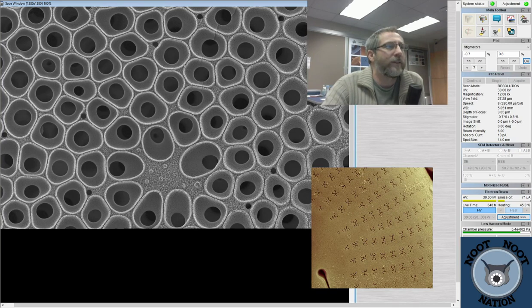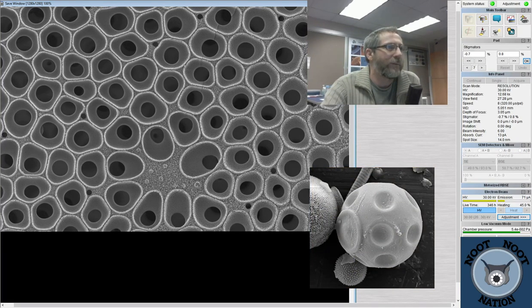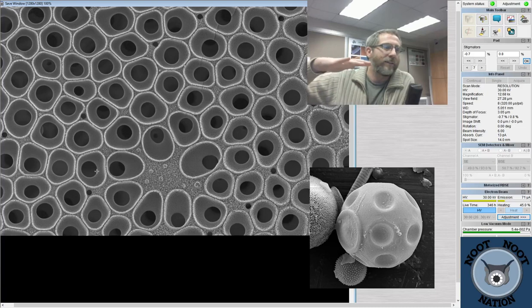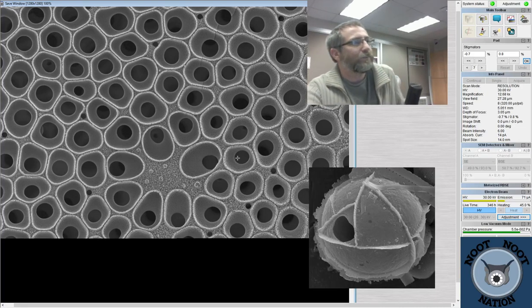So it's the very center of the valve. And I think when diatoms like this form their valves, they start with this area right here, and they build outward, a sort of network outward. And they basically layer up and down the structures from there.